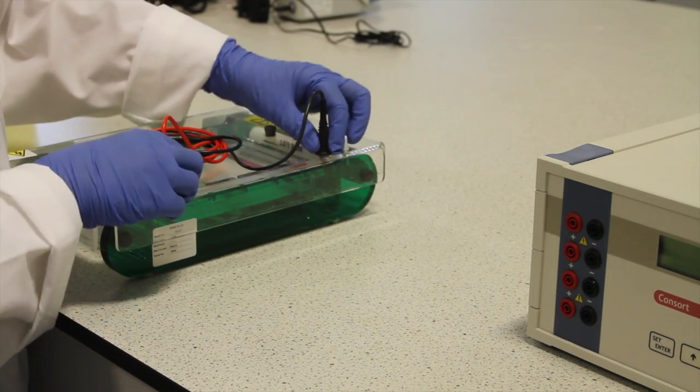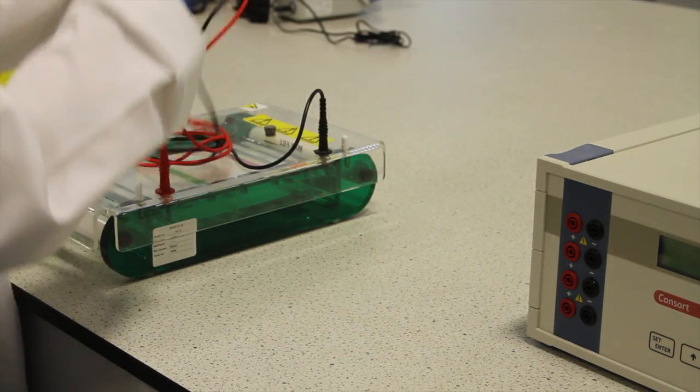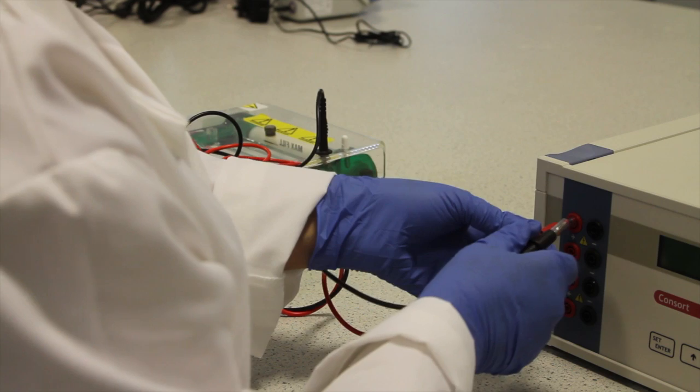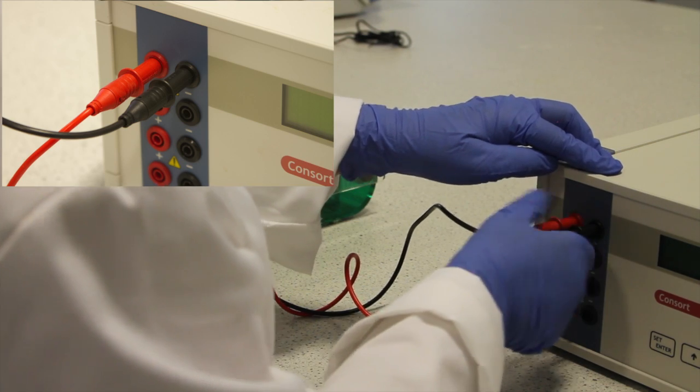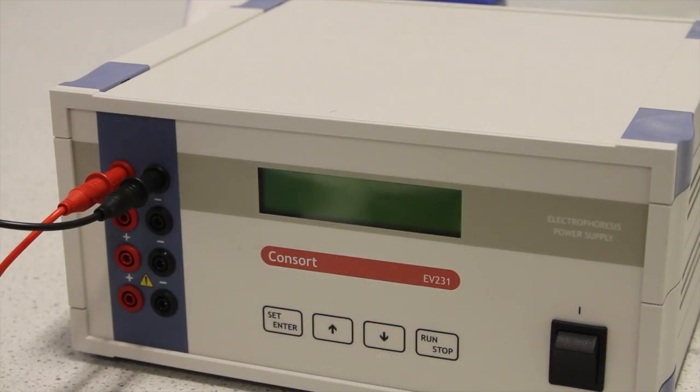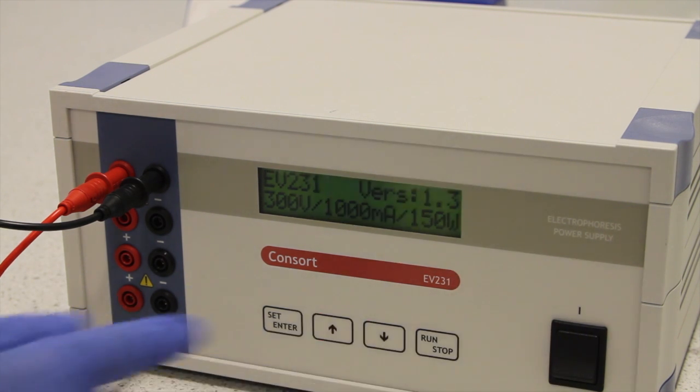Once the markers and samples are loaded, place the lid on the gel tank and connect the power leads to the power pack, ensuring these are connected in the correct order, red to red and black to black.